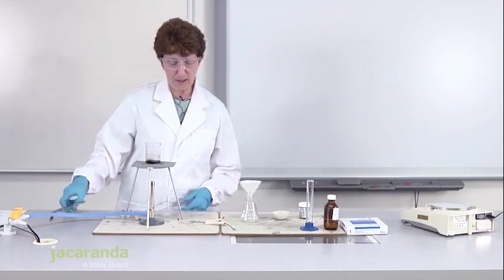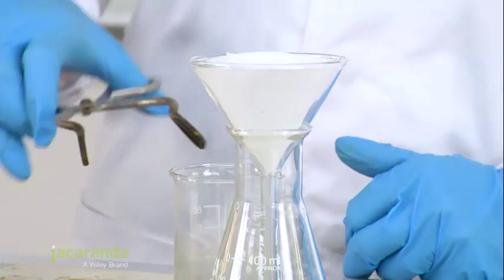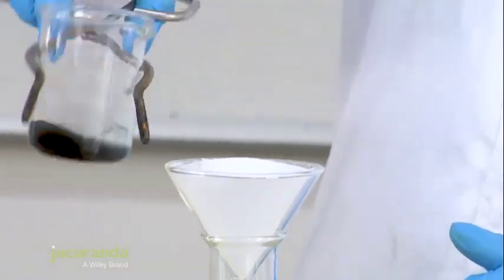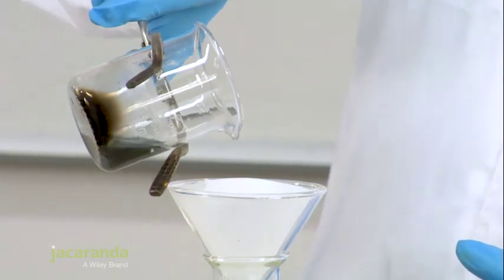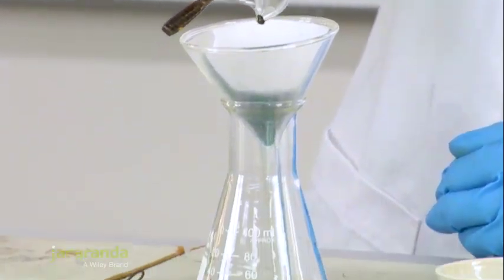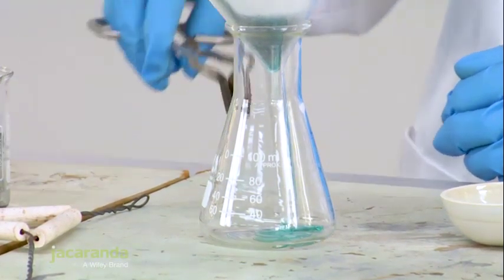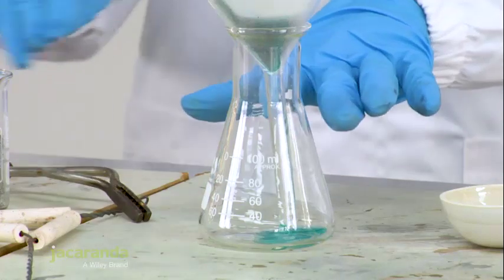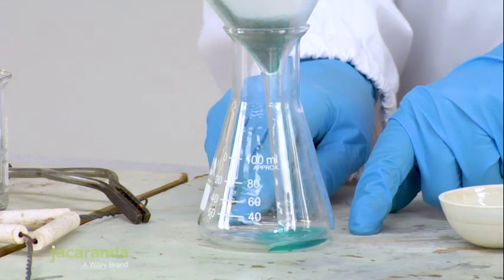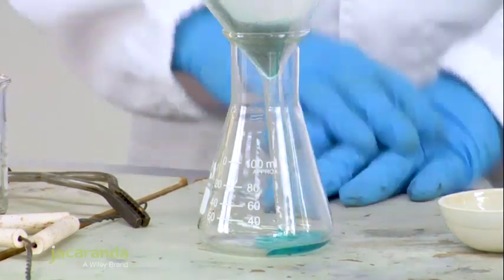We can take it over to the filter flask and pour our solution. Give it a bit of a shake and pour our solution into the flask. You'll notice that there's a clear blue solution in the bottom part of the flask. That's known as the filtrate and that's copper sulphate solution or copper sulphate aqueous solution.